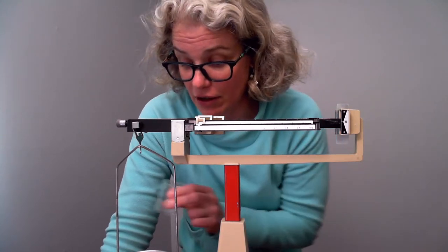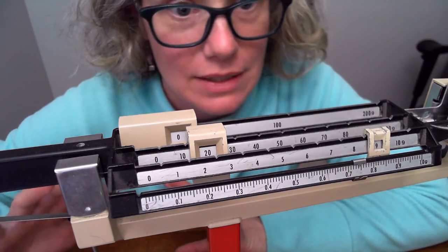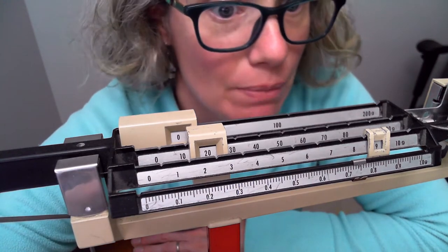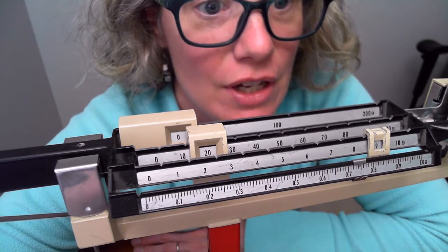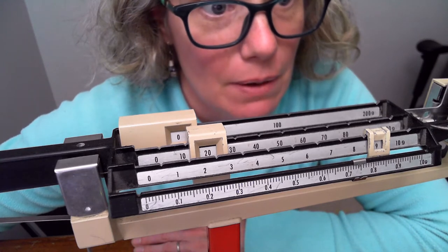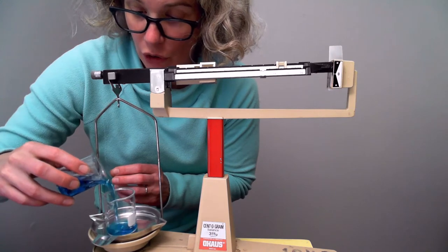The first step is to take your container — in this case a beaker — and find its mass. After zeroing the balance, you read the bars: 29 point 7, and between point 7 and point 8, not quite two and a half lines over, so it's 29.74 grams. That is the mass of the beaker alone.